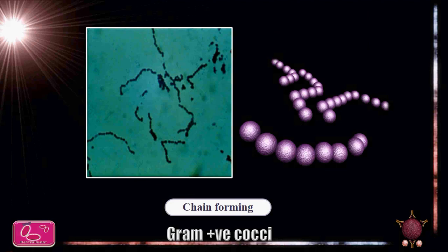So first of all, if you want to comment on a gram stained smear, firstly you comment on the color. So what is the color, for example? Here we have two colors, either violet or blue, or red. As you can see here, the color is blue, but blue and violet is just in your mind.